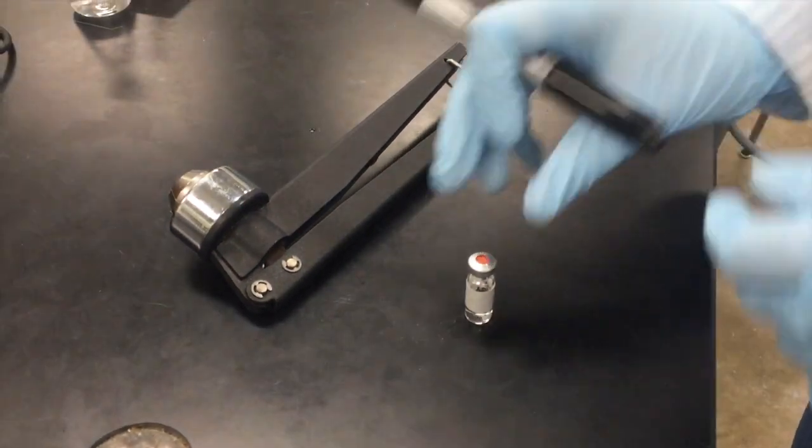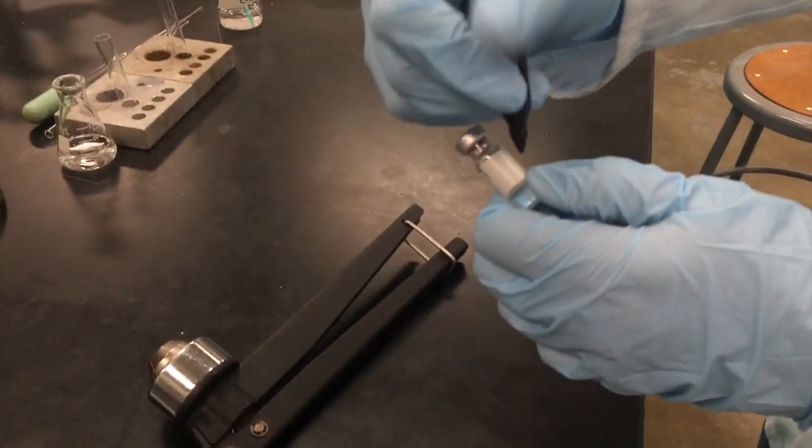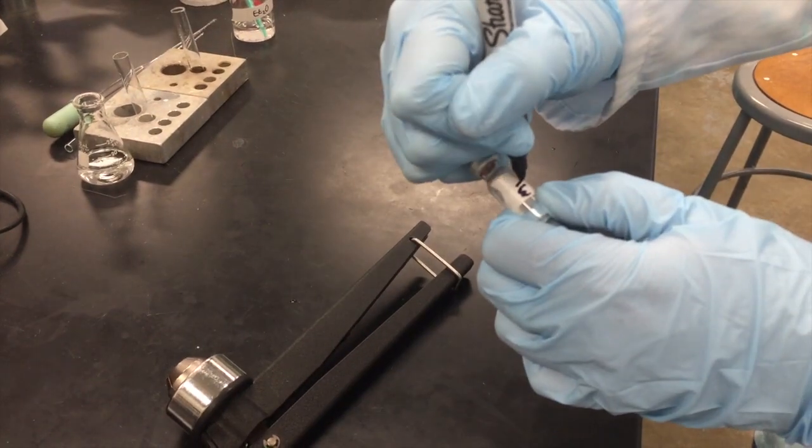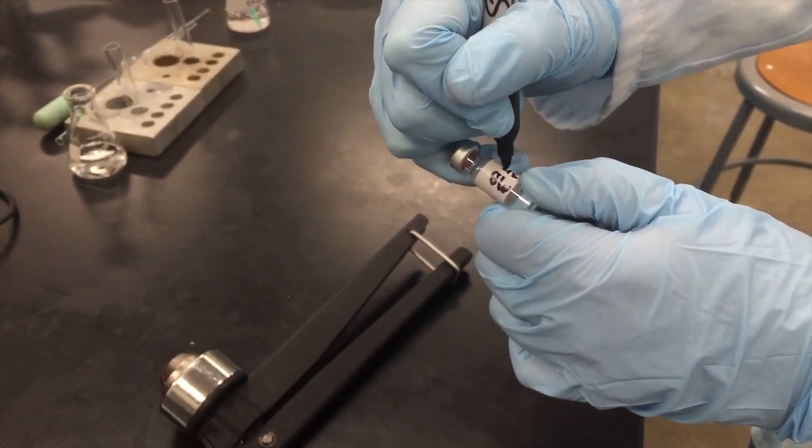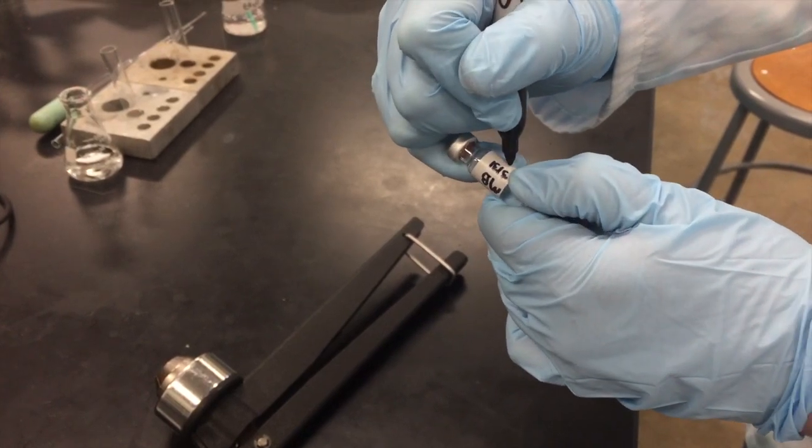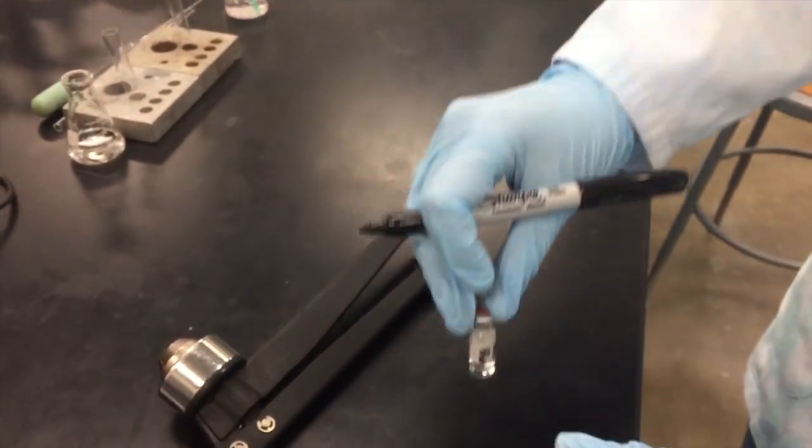Label the vial by attaching tape and writing your initials, section number, and date. Now your sample is ready for GC-MS.